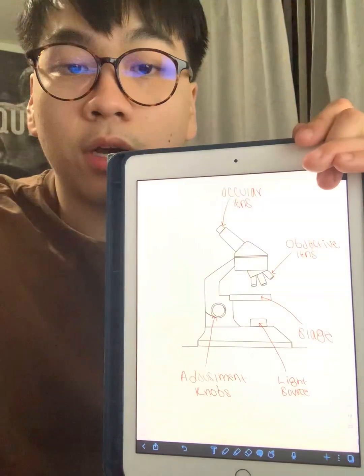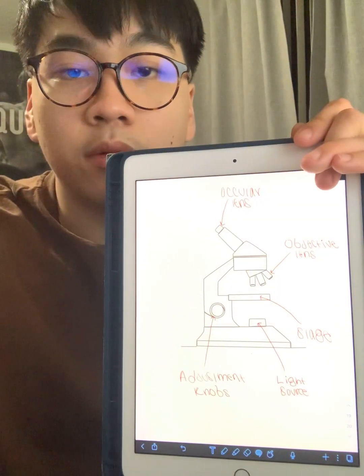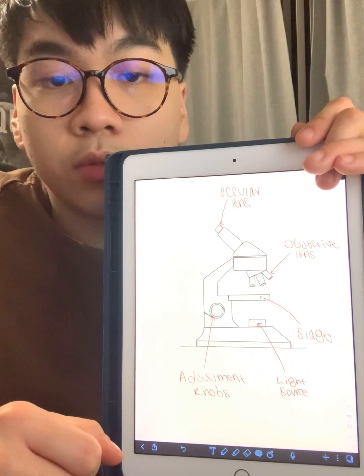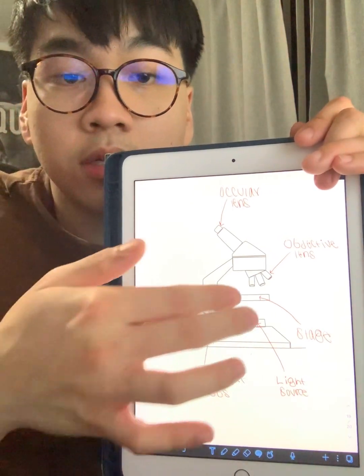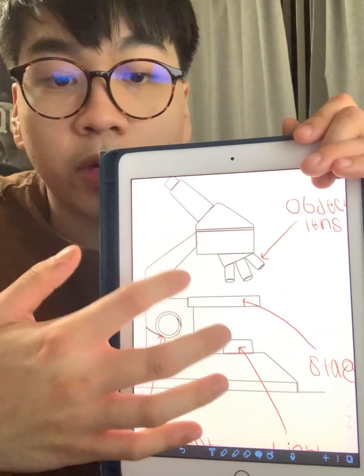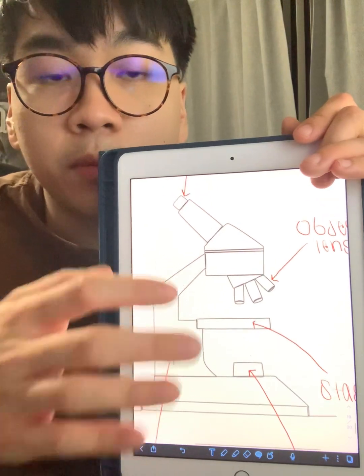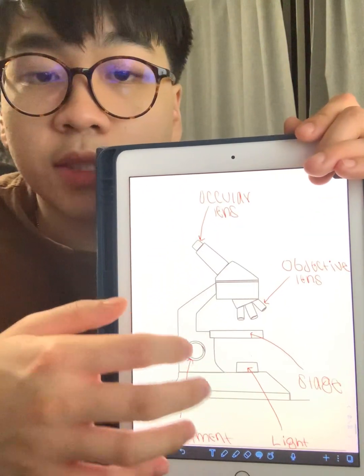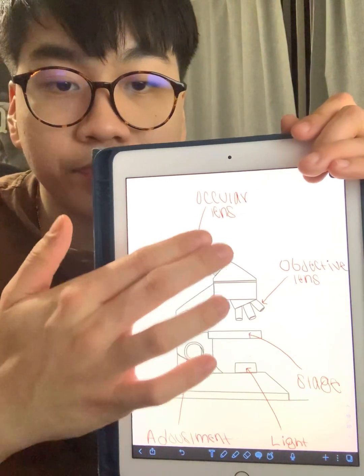Hi, my name is Aaron Ho, and in this video we're going to be talking about the microscope. So some properties of the microscope include magnification of small objects. With the microscope we're able to look at things that we normally can't look at with the naked eye. So let's go over some of the parts of the microscope here.